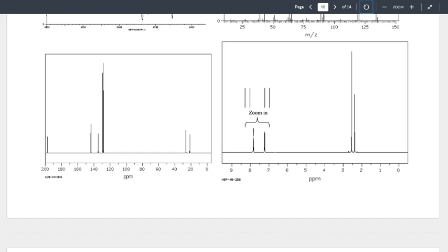You might be able to go through and say, these are 1-to-1. Those are about the same height. Okay? But these other ones are significantly taller. Well, how much taller are they? Well, if I get out a ruler and take that, and then I go that, and then that, and then that, right? I could now go through and say the height of those would be 3-to-1 for this one, maybe. But this next one is even taller still.